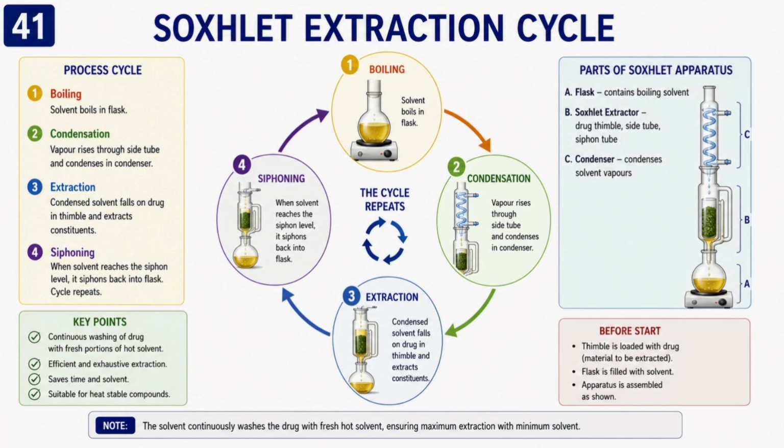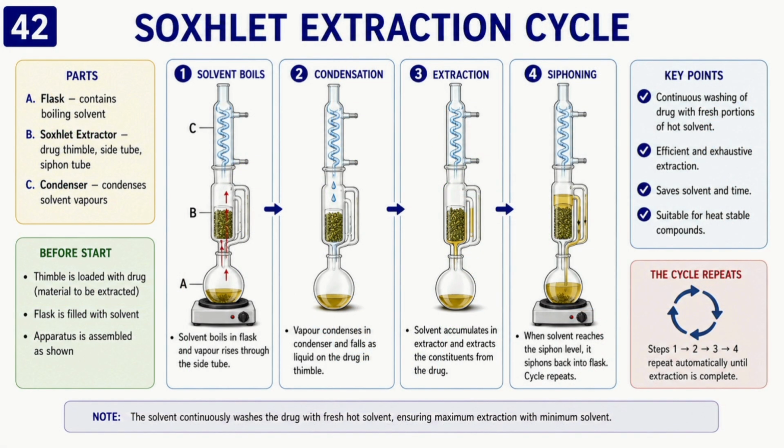A beautiful example of solvent recycling within an extraction system, where the drug repeatedly contacts the condensed solvent. Students, imagine a tiny automatic washing machine for crude drugs. It repeatedly supplies the solvent and removes the extracted constituents here. So this is a simple way to visualize Soxhlet extraction.